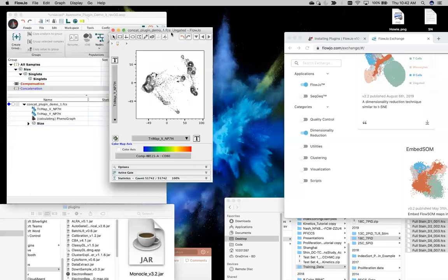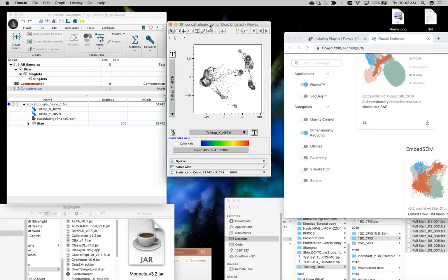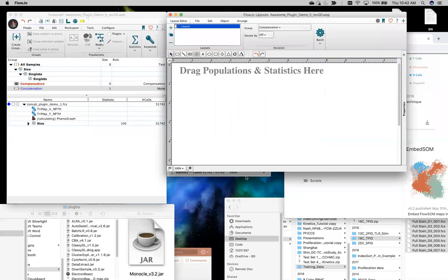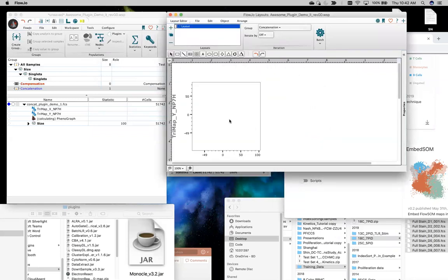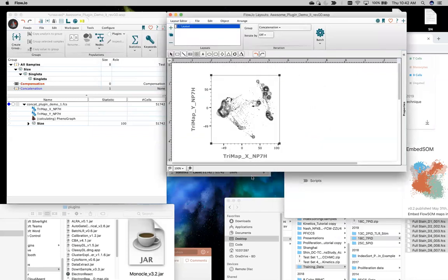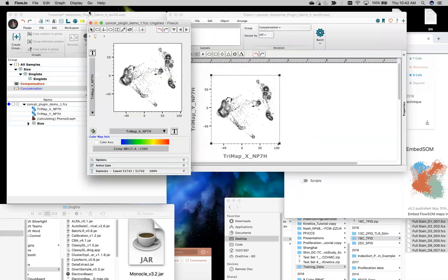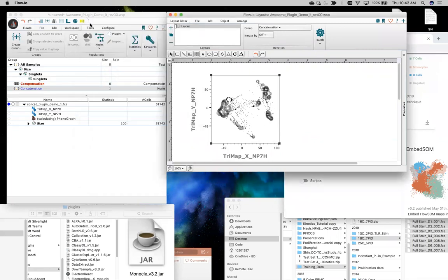But you might notice in some of my demos, I typically just click Command L, and that should automatically add the plot to the layout. Oop. Sometimes it takes 2 tries. Let's try that one more time. There we go. And that's just a hotkey to get this plot into the layout. But if you notice me just popping plots into the layout editor willy-nilly and it looks like magic, it's because I'm using that hotkey.